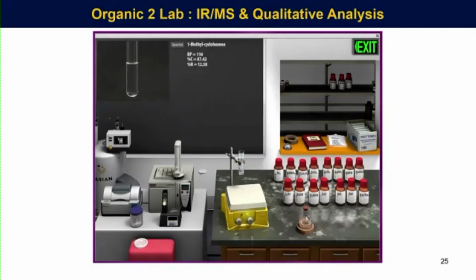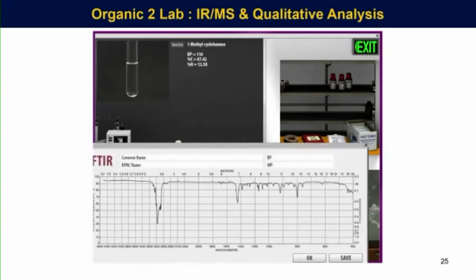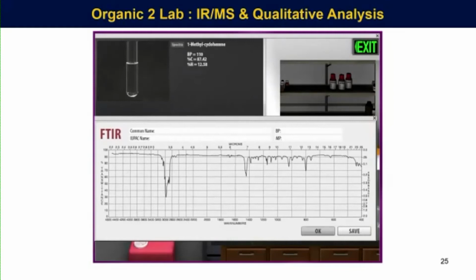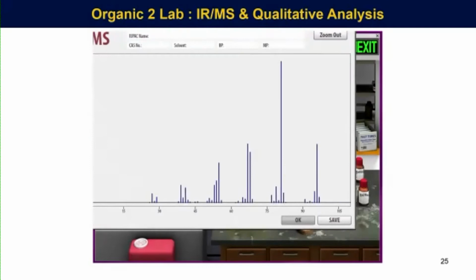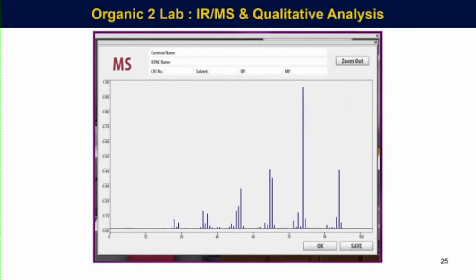And then we moved into doing the actual spectroscopy. Infrared spectra, I love the fact that the database is huge. I think there are 700 and some spectra in there. So one of the problems I've always got in organic chemistry at the sophomore level is getting eyes on spectra, is getting kids to have spectra in front of them to recognize they don't all jump around, signals don't move, this is reliable and this is predictable, and this really worked.